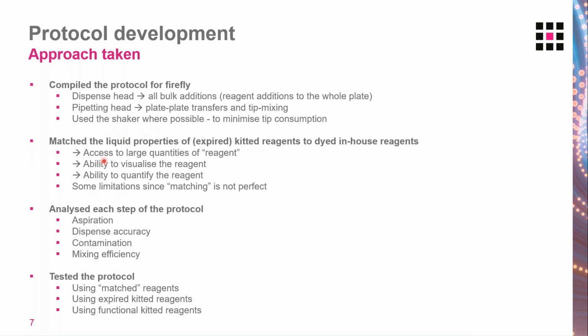The next thing we tend to do when developing protocols is a reagent matching exercise. So the problem we have with next generation sequencing reagents is that they're quite expensive, there's not much volume available, and they're colorless. So for development purposes, this is not that favorable.